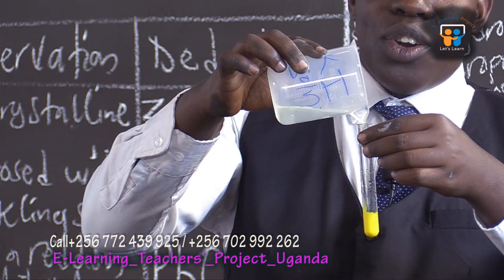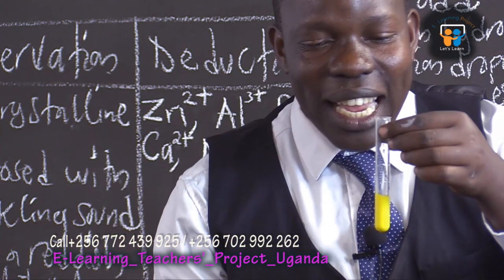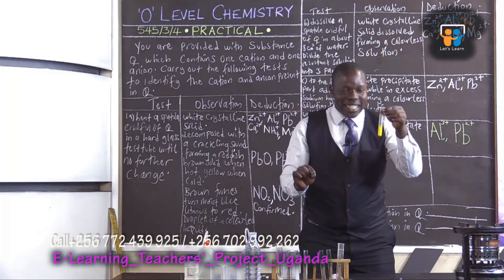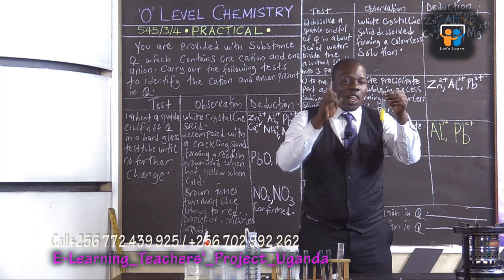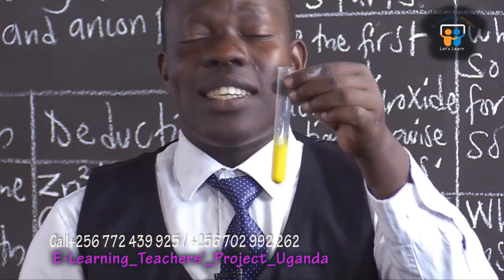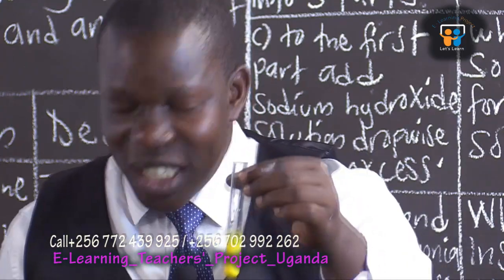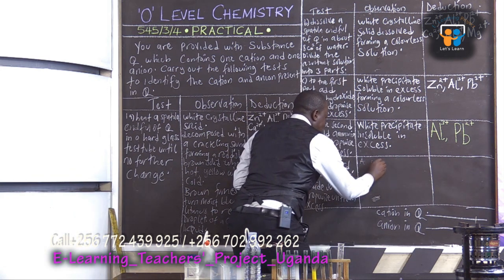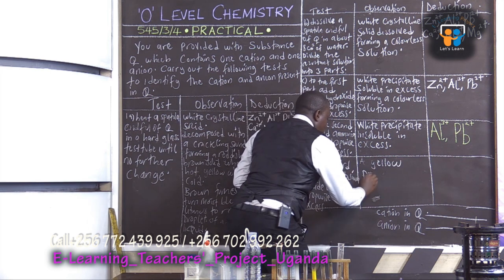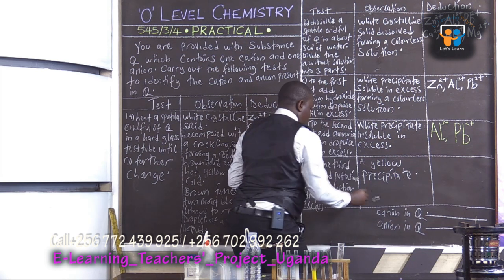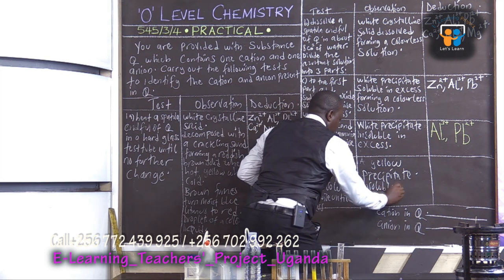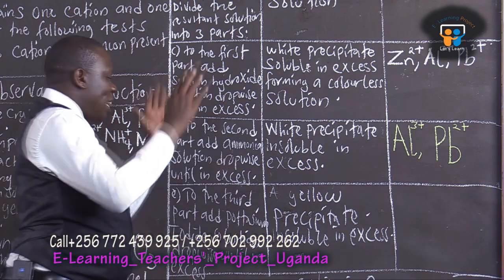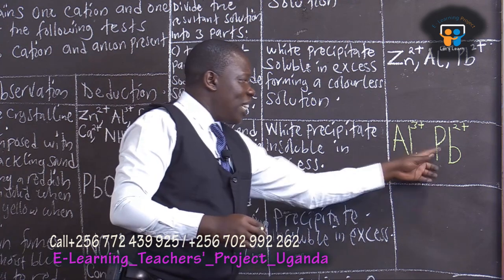We have actually seen yellow. I don't know whether the majority of you out there are seeing yellow. That yellow tells us that this solution contains lead(II) ions. Hope you have seen the yellow, ladies and gentlemen. This is our yellow precipitate. Because we have seen a yellow precipitate, we therefore write: a yellow precipitate, insoluble in excess. The moment we see yellow with potassium iodide, we confirm nothing else apart from lead(II) ions.